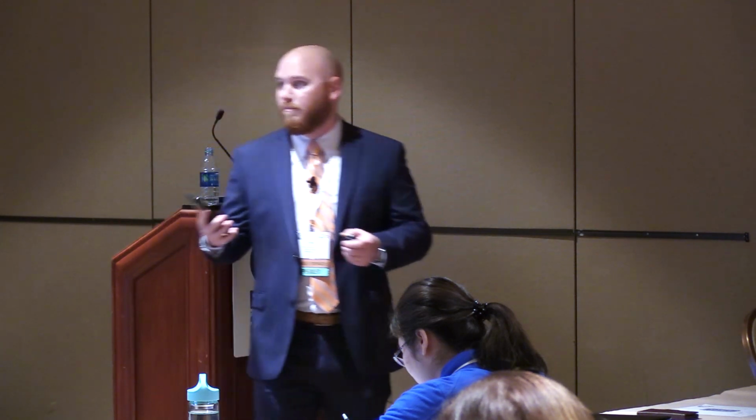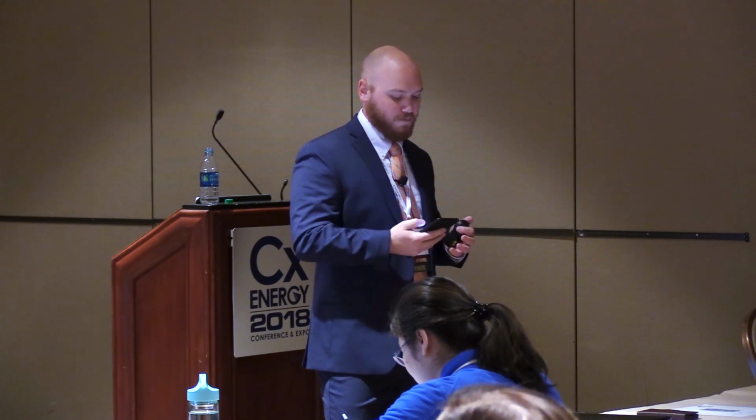So when you're working with such low tolerances, any kind of little dust particle in that flow ring can mess up that flow. And small changes make great sacrifices, I guess you would say. If you're 5% off on the low side and 5% high on the high side, you're talking a 10% swing there, and that affects your air change rates, it affects your building pressure or your room pressurization. All that is affected. So you also have yearly fume hood calibrations that take place. They're looking at sash height position, making sure that we're obtaining that 100 feet per minute face velocity that we want to get.